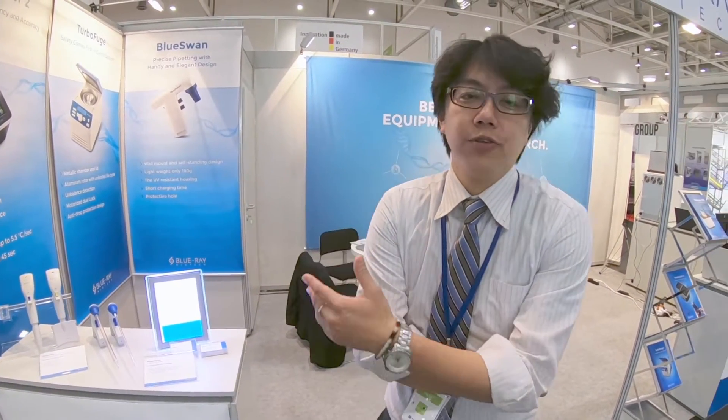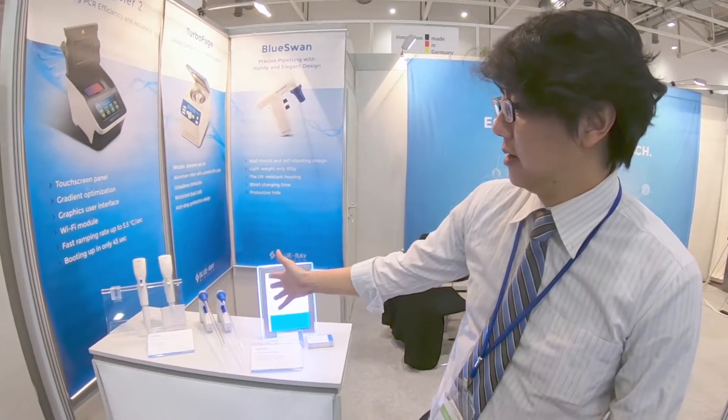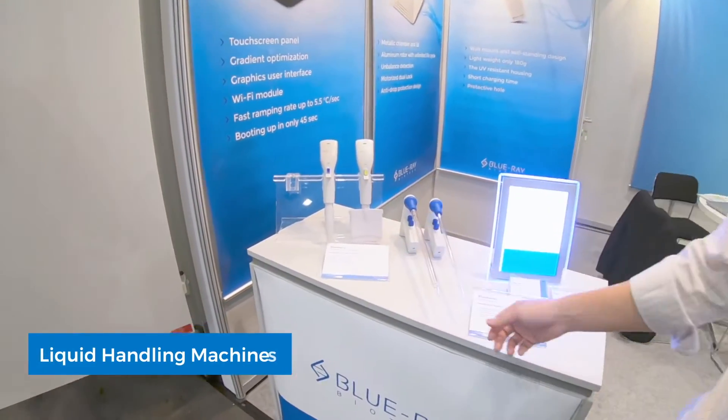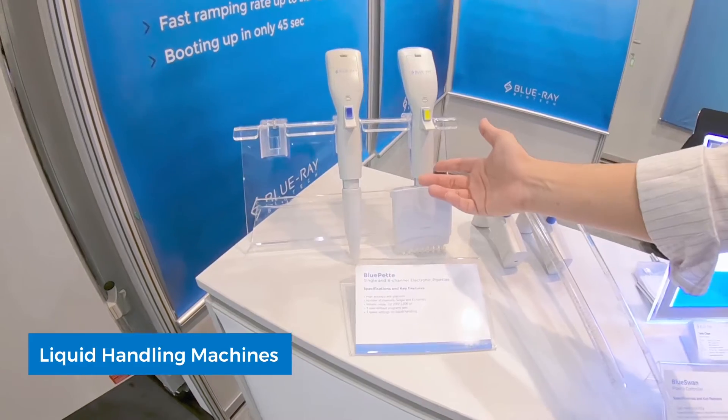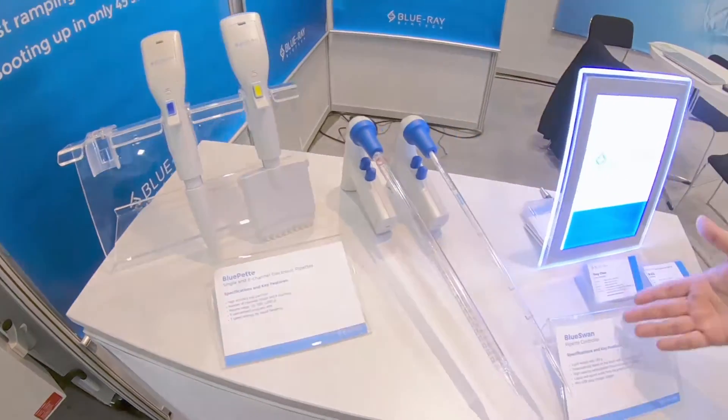Today I want to introduce a range of our products, step by step. For our product line, we separate it into four parts. The first one is the liquid handling machine. We have the electronic pipette and pipette controller, which are called the BluePeg and the BlueSwan.